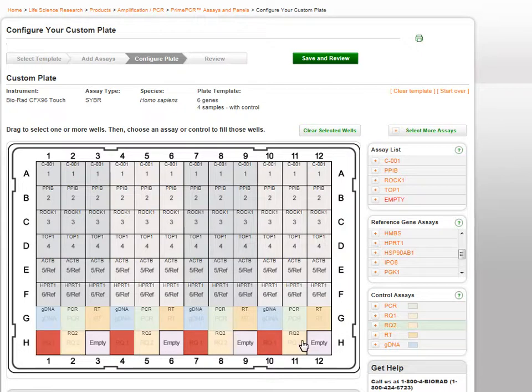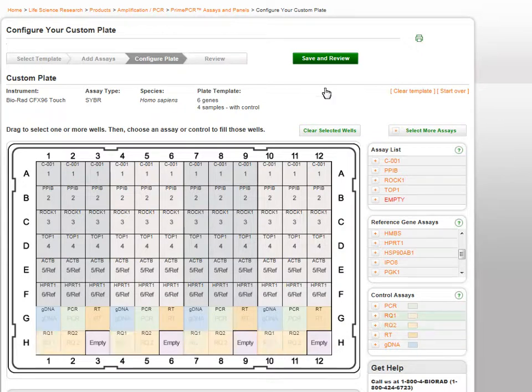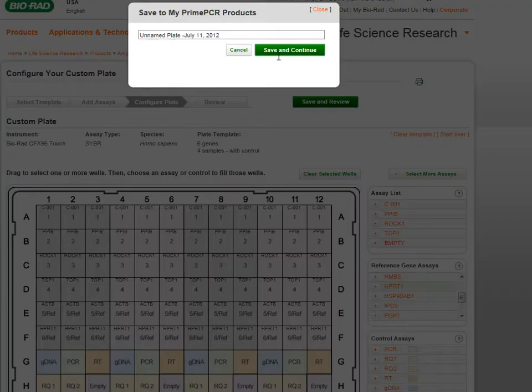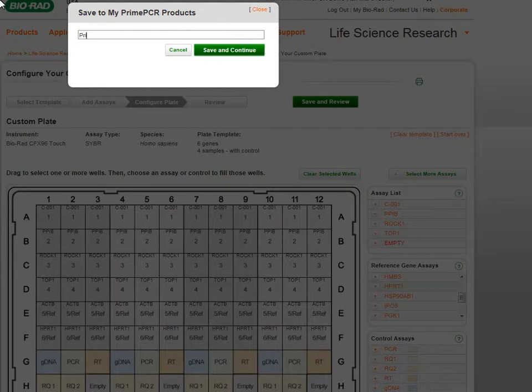When you have finished completing your plate, click the Save and Review button at the top right. If you are not logged in, you will be prompted to log in to your account. You will then be prompted to name and save your plate. Click Save and Continue.